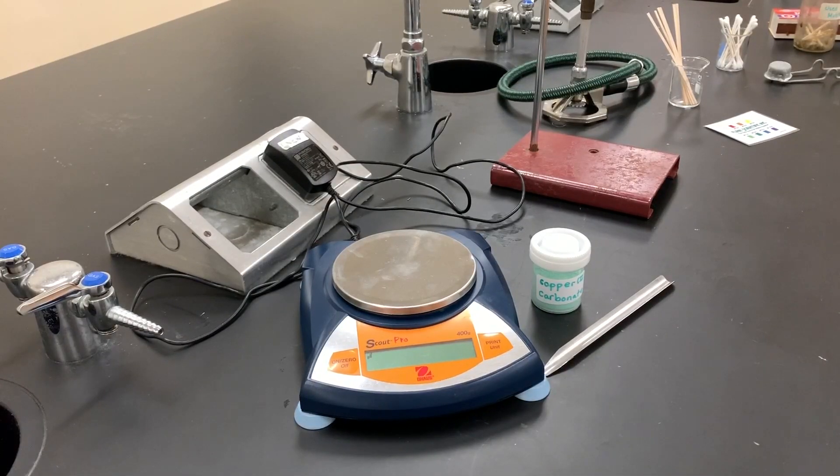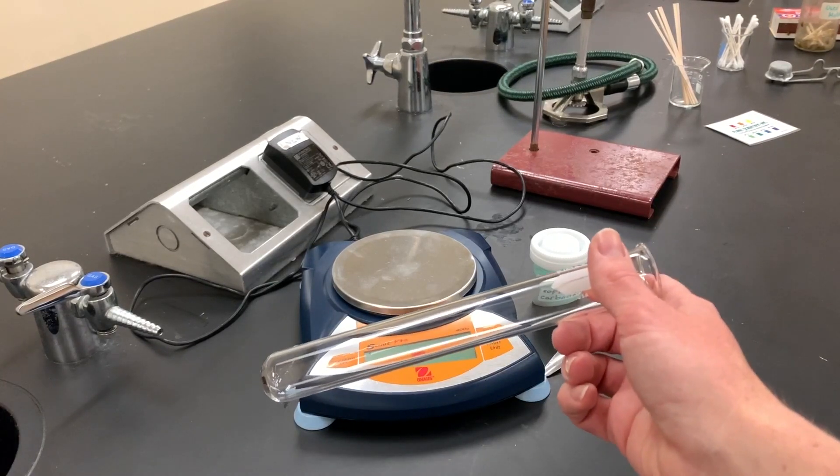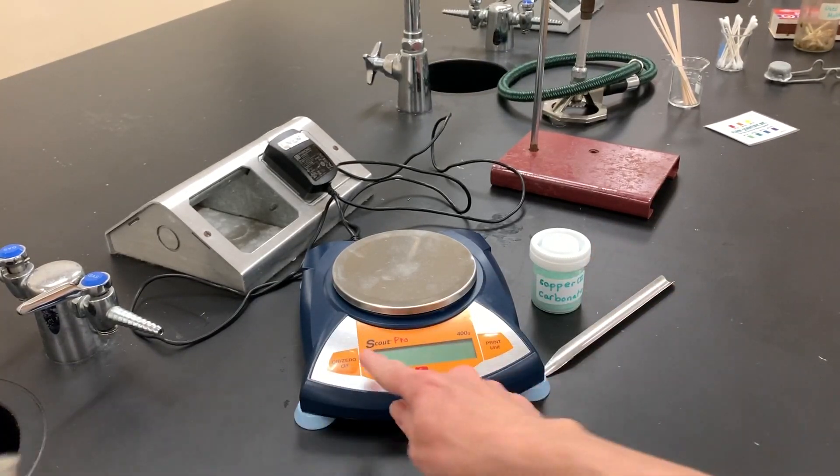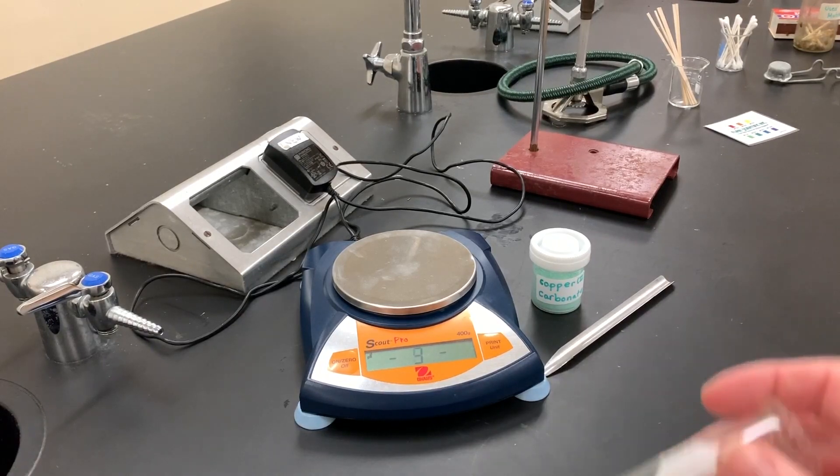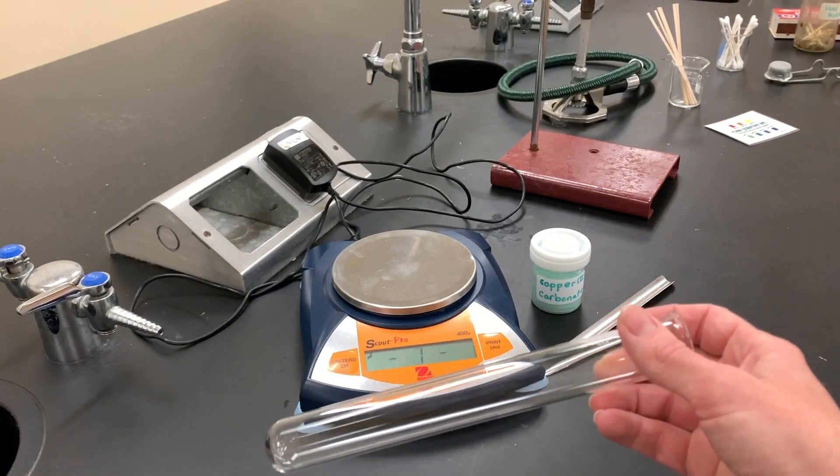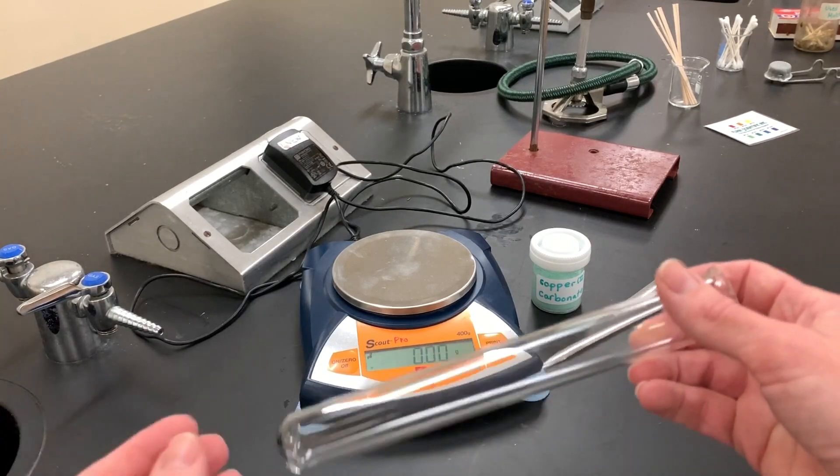The first step to starting this lab is to grab your test tube. It should be clean and dry. Turn on your electronic balance, let it go to zero, and make sure that it says grams.